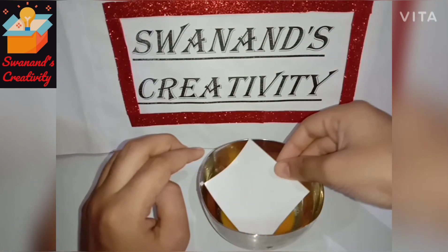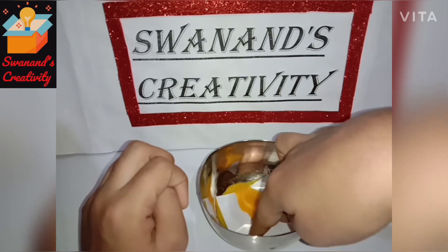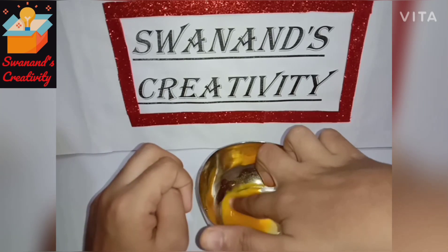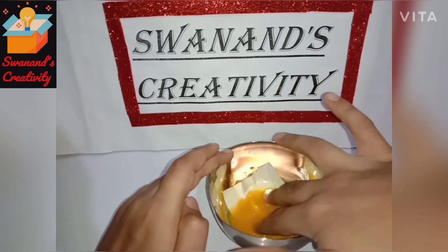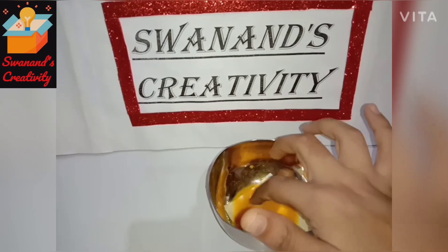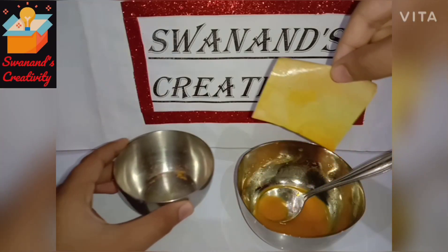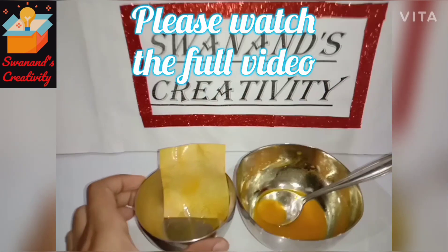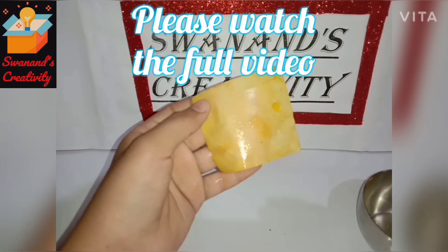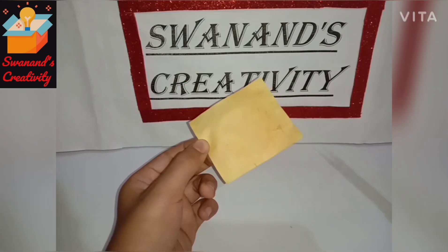Now dip the piece of paper into it. After 10 minutes, remove the paper from the turmeric water and keep it to dry. After drying, make strips of the paper.